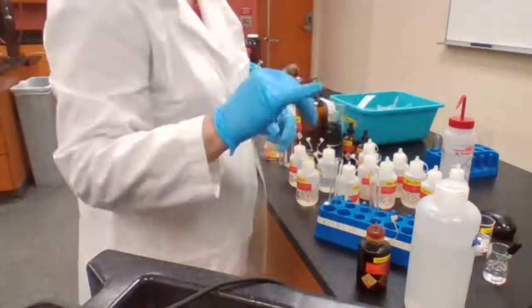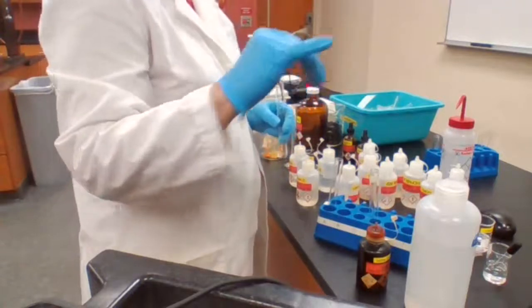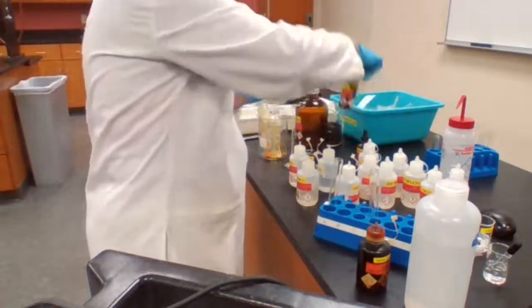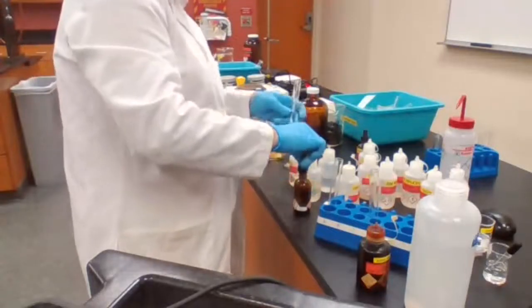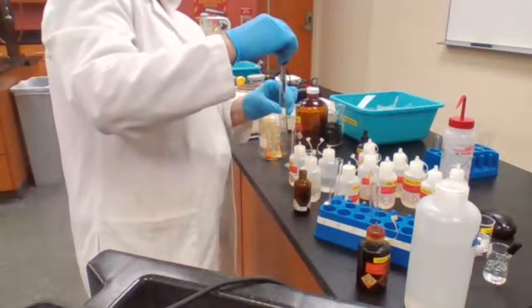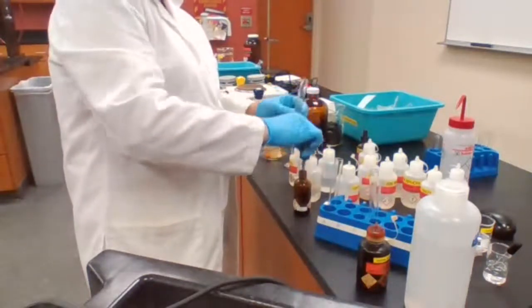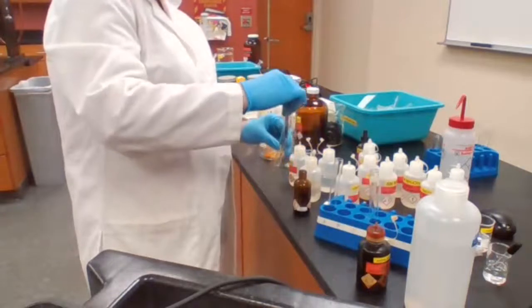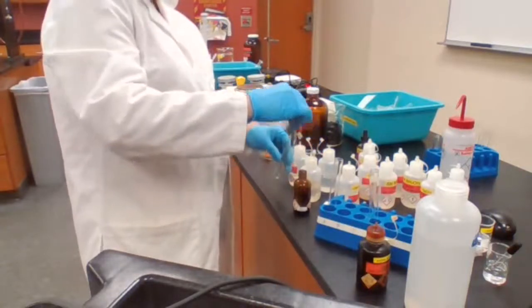So first step, 1 milliliter of silver nitrate. And 1 milliliter of silver nitrate is 20 drops. I'm going to use 2 milliliters of silver nitrate because I want to divide it and put it in each one separately.